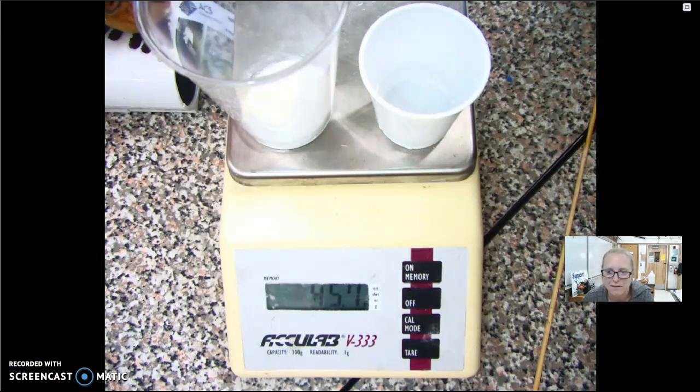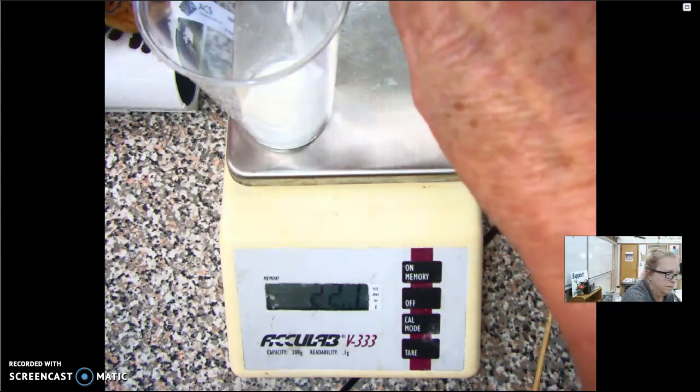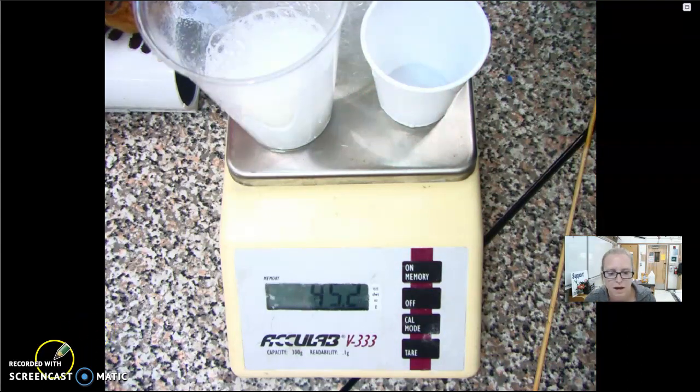So we are back with trial 2, and our initial mass, or mass initial, not temperature, sorry, is 45.7 grams. And all we got to do next is combine it. So let's see what happens. Okay, you can make some observations. I'll be back in a minute.